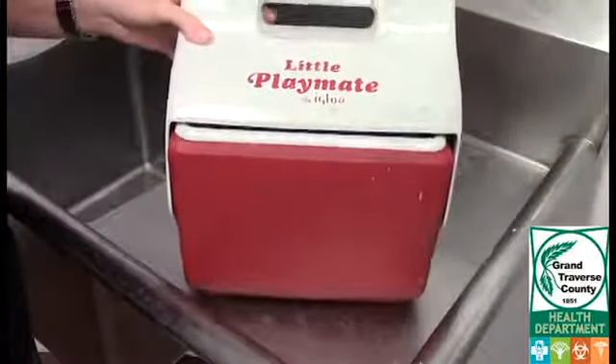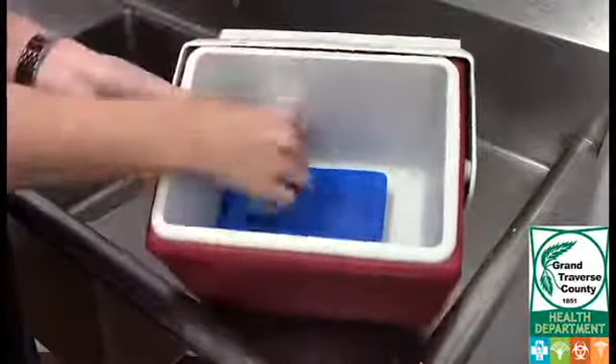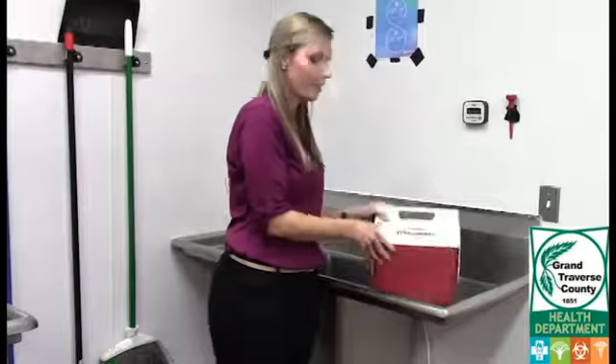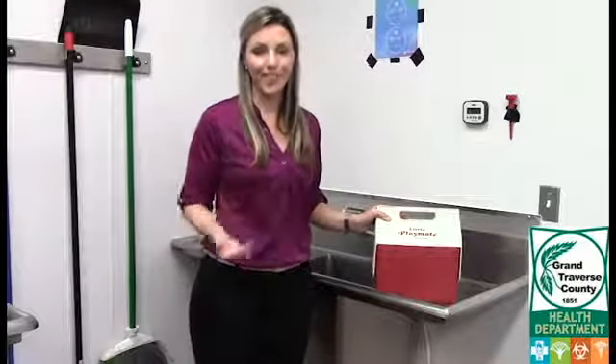Once you've collected the sample, place it in a cooler with ice or ice packs to transfer to the lab for testing. Then all you have to do is make sure it gets to the lab within 30 hours of taking the sample, and you're all done.